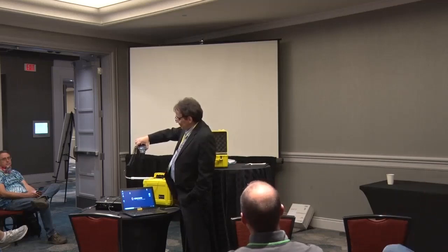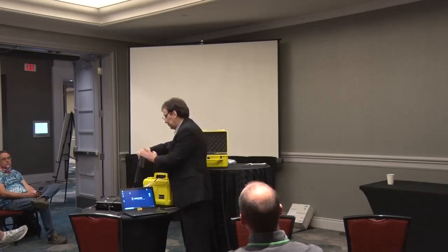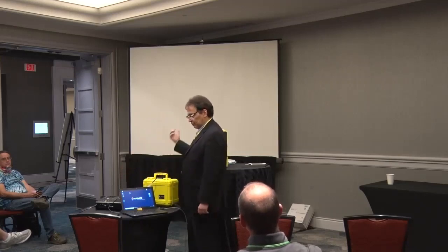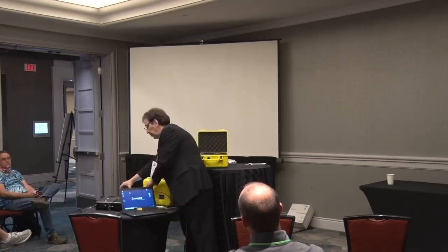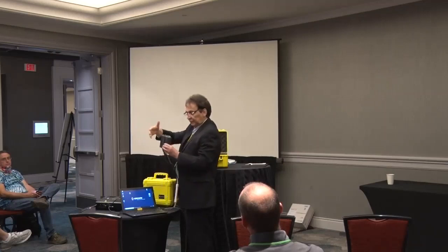It leveled out at 800, so we know that's kind of where it's at. Then it got to 1,000. It still bounces around, but you're definitely the source here. Now you don't want to be in here forever, because radon decay products will plate out on the side here, and they don't get flushed out.